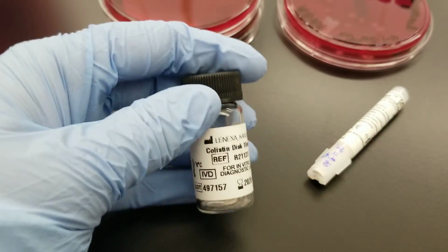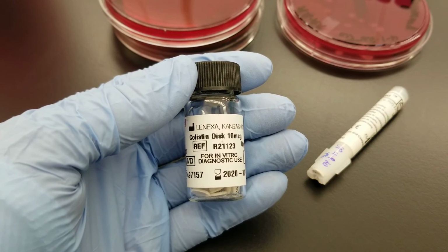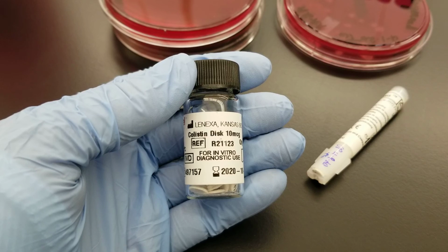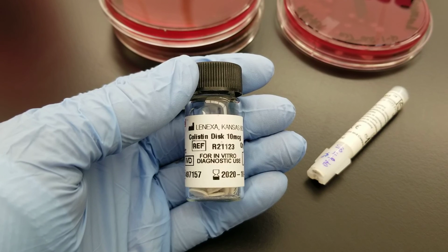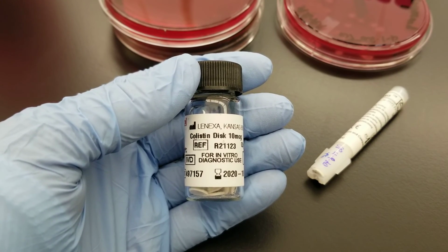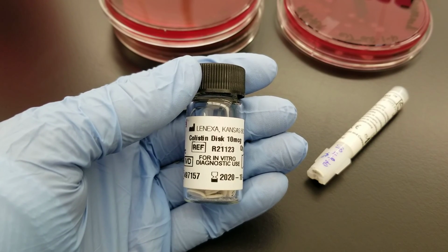The chocolate agar plate that is anaerobically incubated is the purity plate. The Brucella blood agar plate would have your antibiotic discs on there. These discs would be kanamycin, colistin, like I'm showing you here, and then vancomycin. And those are not used for susceptibility testing.